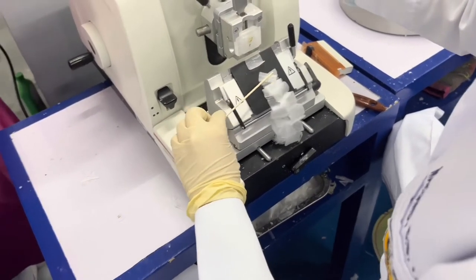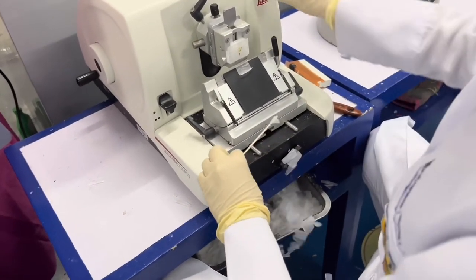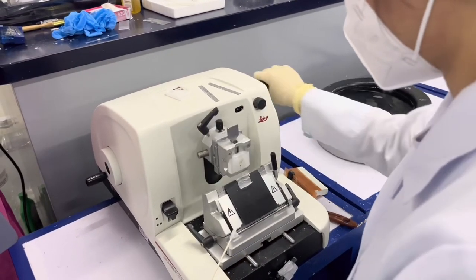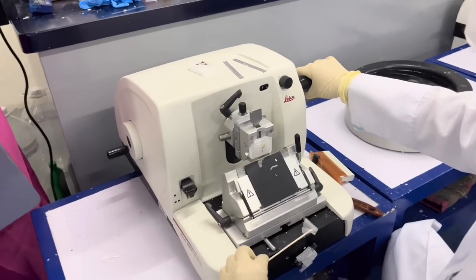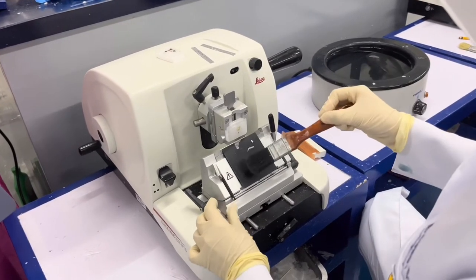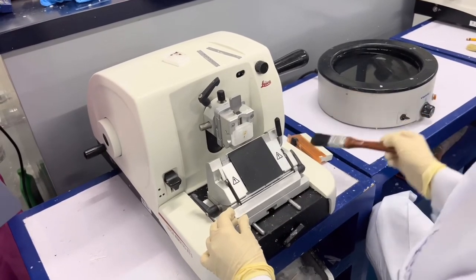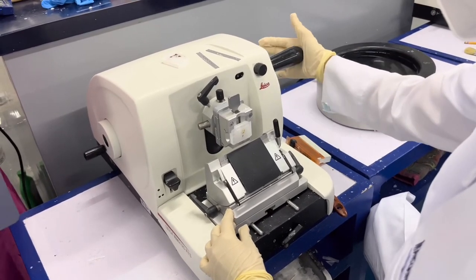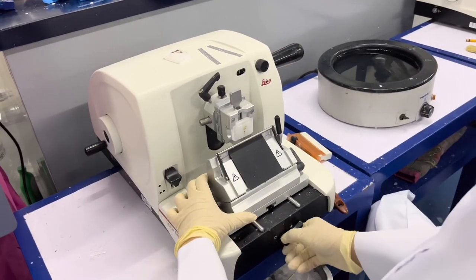If there is already similarity, then you can stop rotating the rotary wheel. Change the 10 microns back to 5 microns, then rotate it twice. Do not forget to clean the microtome, lock all the necessary parts, and put it back in its original position.